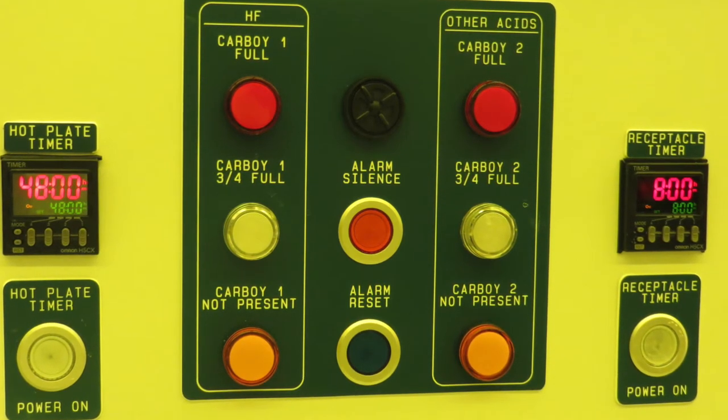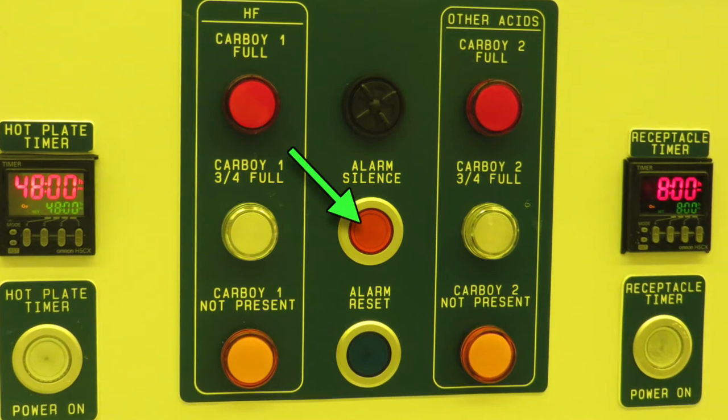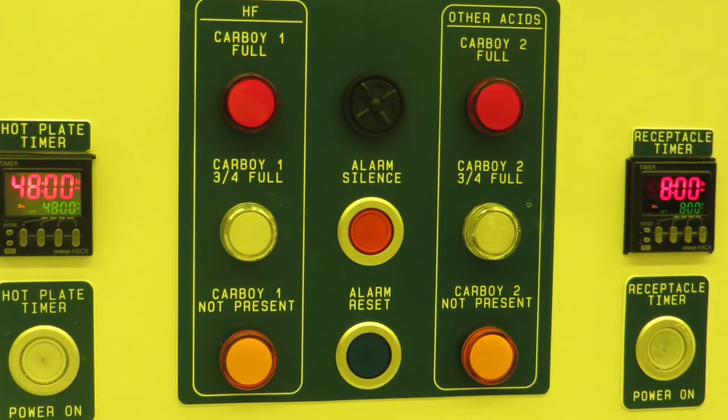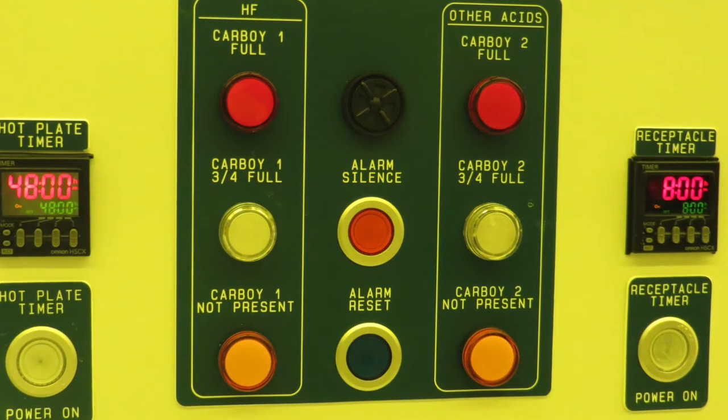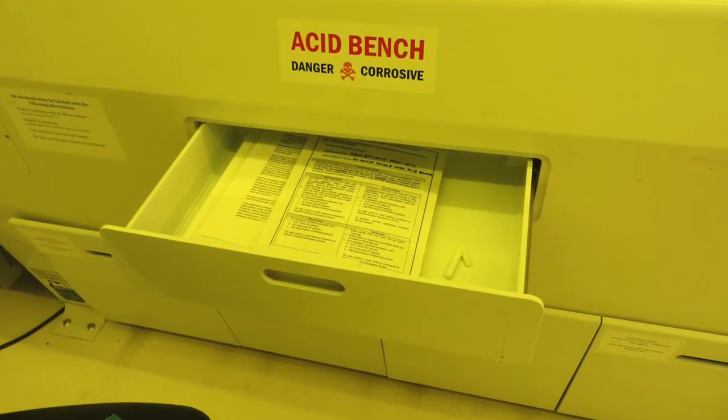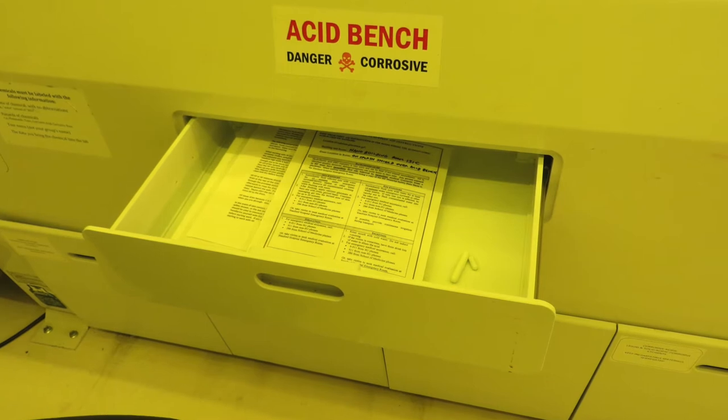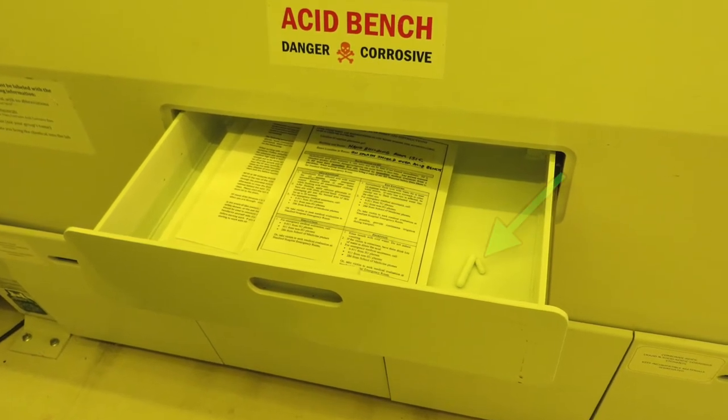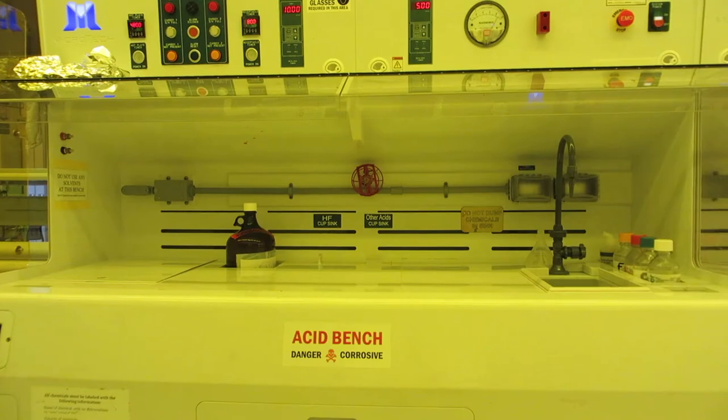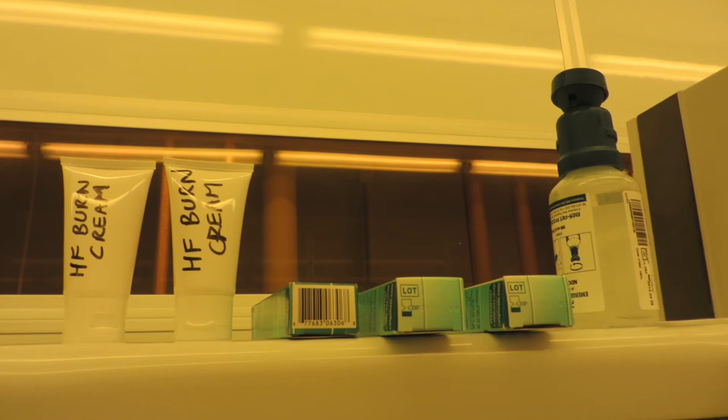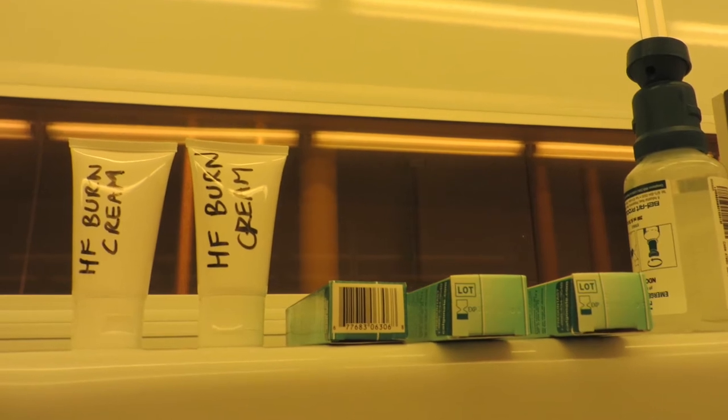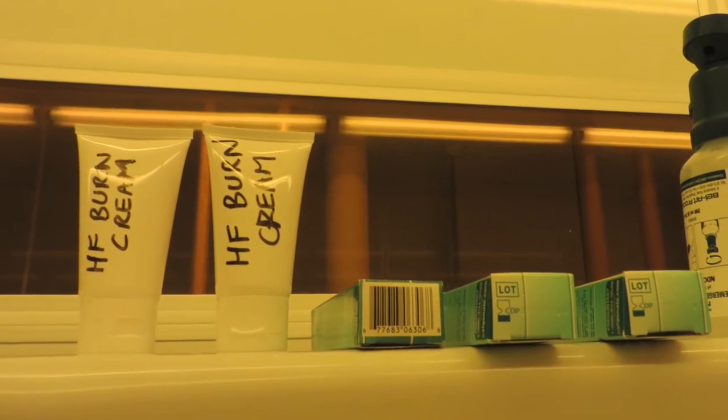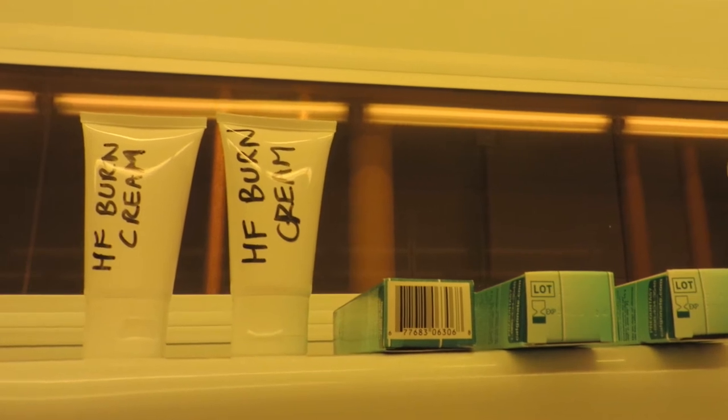To turn off the annoying alarm, you can push the alarm silence button. That button will blink red. Once the carboy has been replaced, we can hit the alarm reset button to have the system work normally again. In this slim drawer under the acid bench, you'll find safety information for working with HF, some magnetic spinner bars, and also the manual for the wet bench. Up on top of the acid bench's head casing are 9x9 cleanroom wipers and HF burn cream. If you suspect you may have come into contact with HF, you would first rinse the area thoroughly with water. The burn cream draws fluorine ions out of your skin while you're waiting for proper medical care.